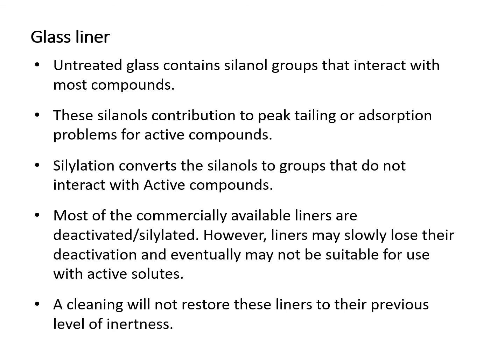Most of the commercially available liners are deactivated or silylated. However, liners may slowly lose their deactivation and eventually may not be suitable for use with active solutes. A cleaning will not restore these liners to their previous level of inertness.